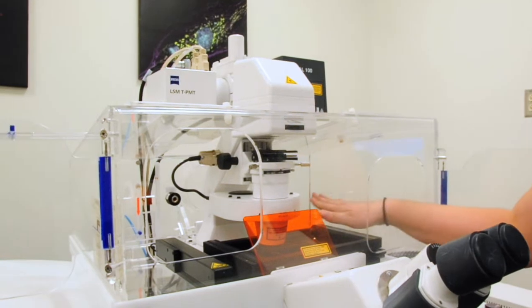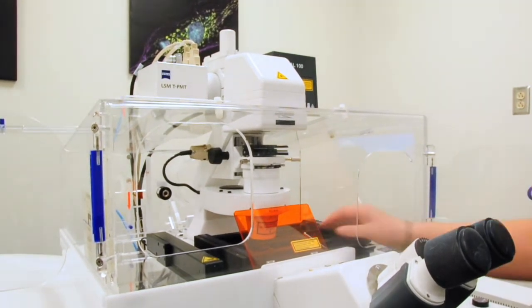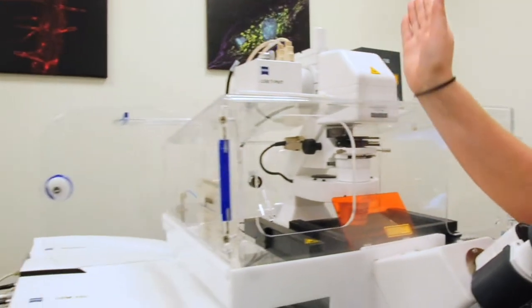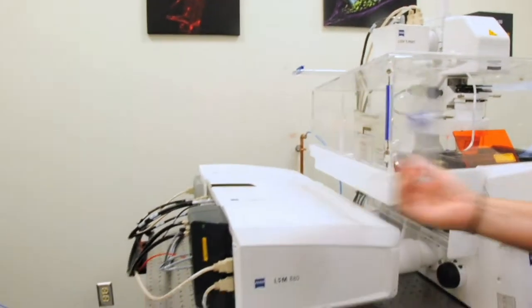As I said, the stage is totally motorized as well as the objectives. And then we can move on to our laser scan pad.